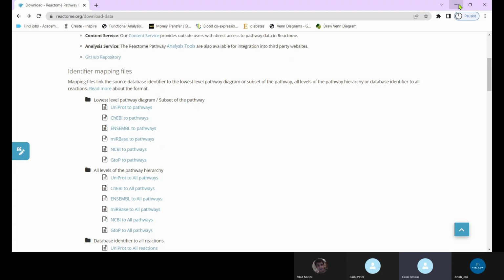Yeah, I still can't see the shared screen, but I'm just opening Cytoscape. That file will be opened in Cytoscape. Before opening that file, you need the output file. So if possible, you can run Fisher or GSEA. Once that output file is generated, we can use it in Cytoscape, mapping over that Reactome database.